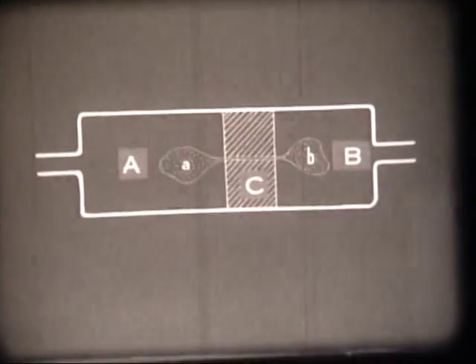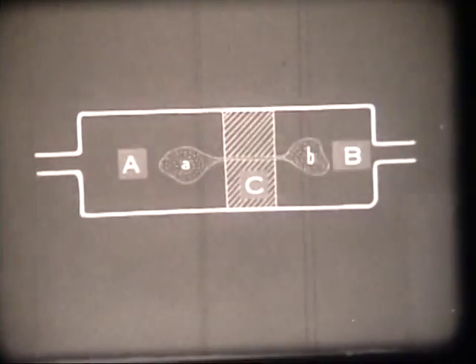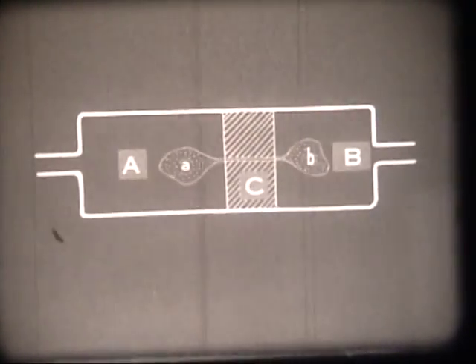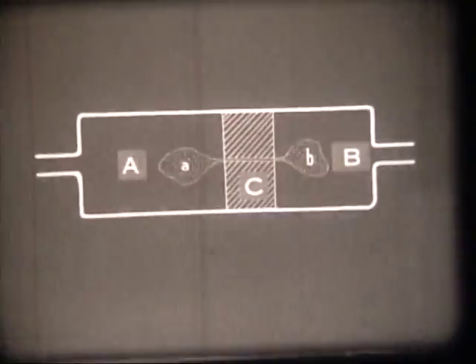Then along came Kamiya, and he said to me, let's measure the horsepower of this living machine. I'll do it by applying pressure or suction, just as one brakes an engine. He built a double-chambered box and put on each side of the central wall droplets of protoplasm connected by a fine living thread. When the flow of protoplasm was in one direction, Kamiya applied pressure and held it quiet. When the flow was in the opposite direction, suction was applied to stop it.